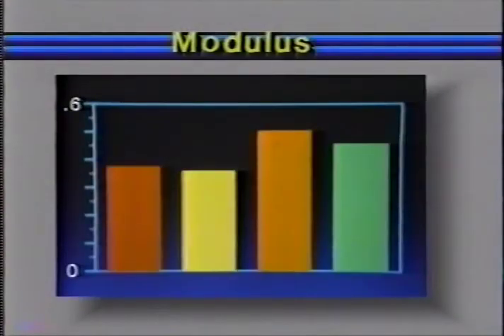For each of these test gels, the computer has tabulated data on the six texture profile parameters. Let's look at the results. In modulus, the gel made with Kelco Gel Gellan Gum is comparable to the plain gel. On the other hand, the two blends of Kelco Gel have a significantly higher modulus value. These differences would probably be perceived as the initial firmness experienced by most consumers.